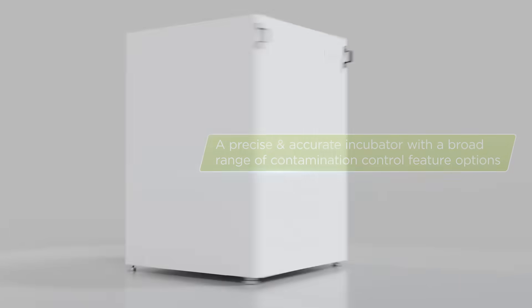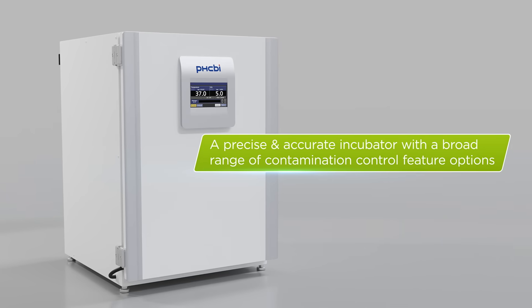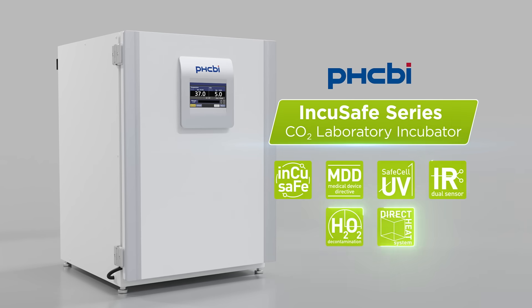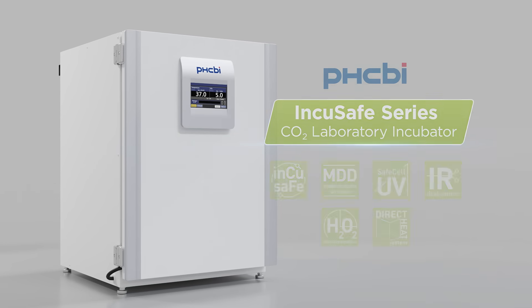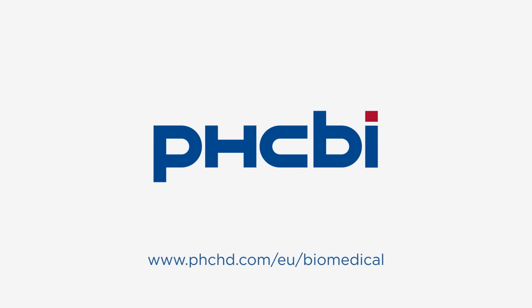Your lab needs the most precise and accurate incubator with a broad range of contamination control feature options. So look no further than the Incusafe Series CO2 Laboratory Incubator from PHCBI brand products. Call your local representative or visit us on the web for more information.